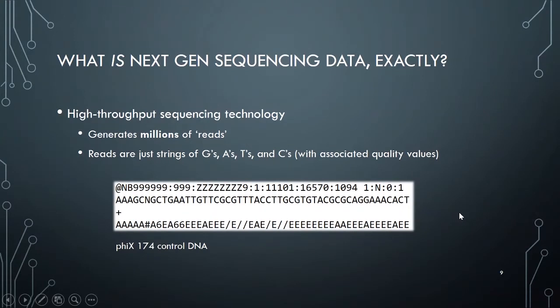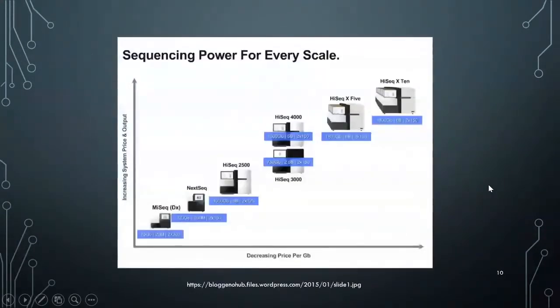And so you can imagine it'd be difficult if you had to do this by hand, or if you had to manually reproduce someone's analysis, because you have millions of these reads. So it'd be best to work that into a reproducible pipeline of some sort. And this is just another slide to explain that it's only getting more and more necessary to have this kind of setup for any data processing, specifically for bioinformatics.